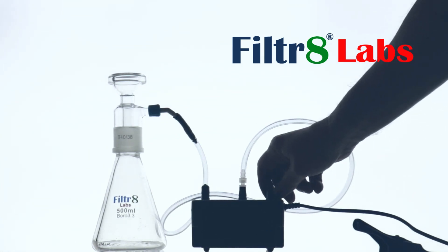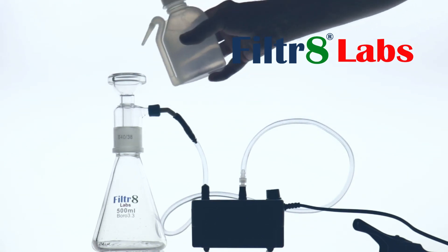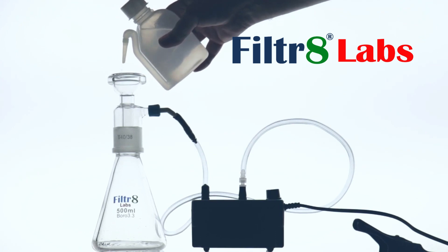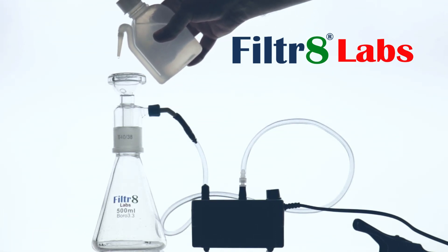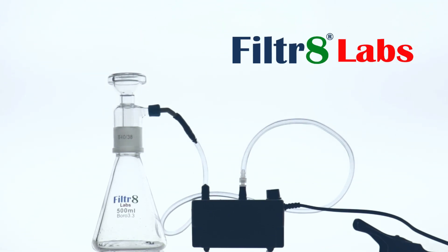You want to put the filter paper on top of the filter head, then take some distilled water and just wet the filter paper. What you're trying to do is make sure that you get a good seal with the filter paper and the filter head before you clamp the funnel on.